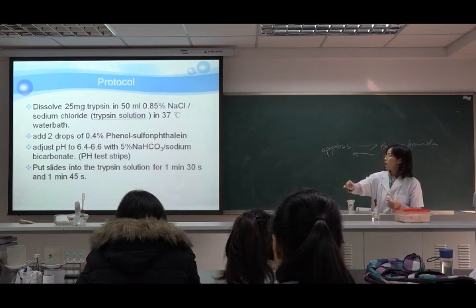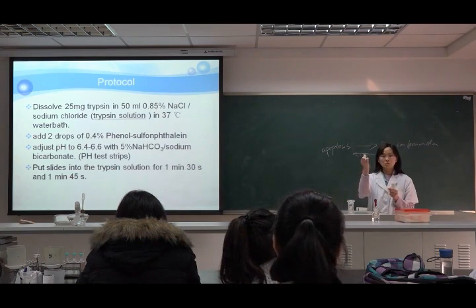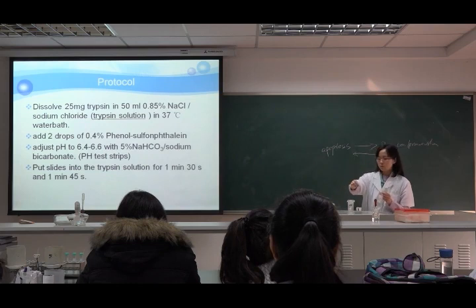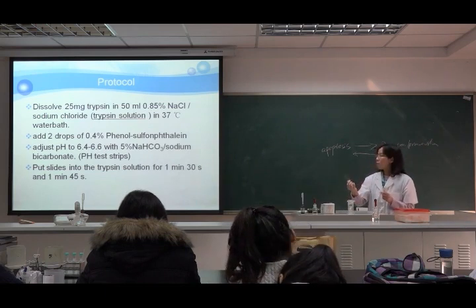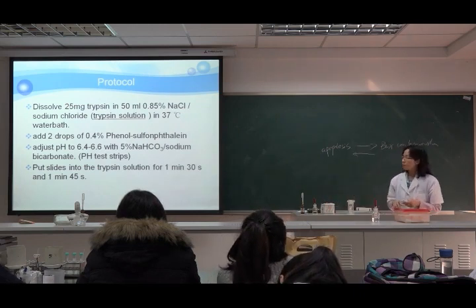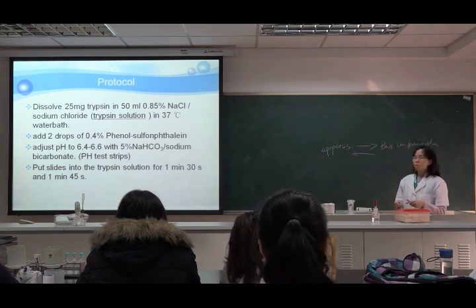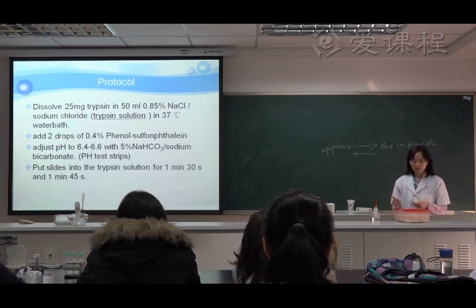Each group has 2 slides, which you prepared last week. Put one into the trypsin solution for 1 minute 30 seconds, and the other for 1 minute 45 seconds, because the time sometimes influences the banding result.